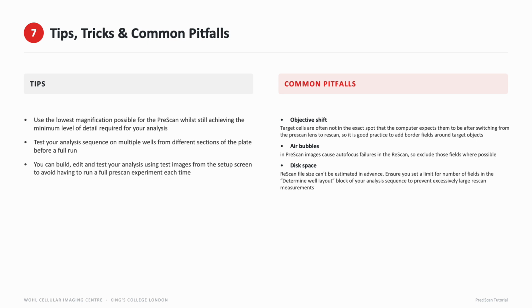And then disk space. Rescan file size can't be estimated in advance because it doesn't know how many images it's going to take. So make sure that you set a limit for number of fields in the determine well layout block when you're setting up your analysis sequence. And this will prevent you from taking too many images if, say, your analysis sequence goes a bit wrong, flags everything as interesting, and attempts to take 70 images per well. It just won't do it. Set your limit to 10, 15, whatever feels appropriate for the data that you need to capture.